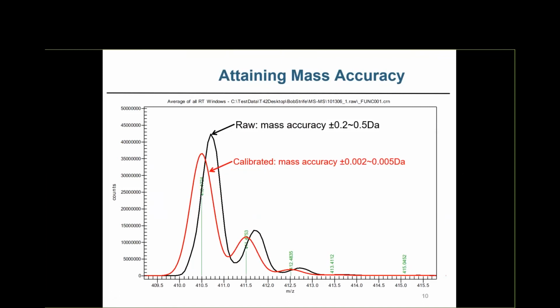That improves our mass accuracy dramatically, from about a few tenths of a Dalton all the way down to about the third decimal place, or about 100 times better mass accuracy. Now, as I said, that still doesn't get you to the point where it's very easy to do formula identification, because you have to use this 5 millidalton window to look for all the potential formulas for an unknown, and so you still get a pretty long list.